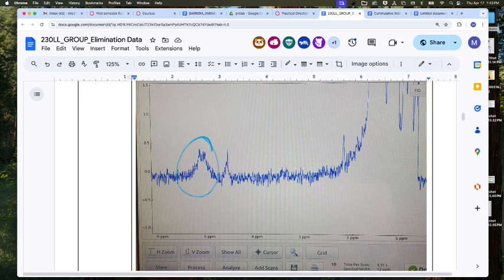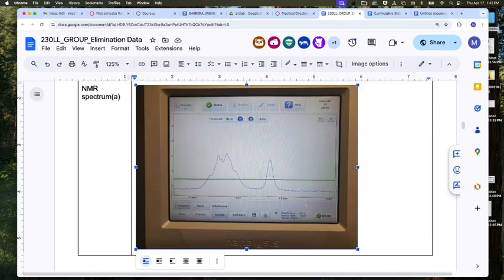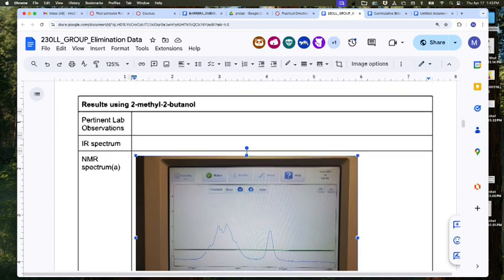Okay? That signal is now the bump upwards. It's so noisy that that's why you're seeing all those jagged lines. That becomes very difficult to go through and interpret because of where it's located. So if we increase the concentration, now we reduce the noise and it allows us to get a better peak. So when we're analyzing the spectra, this is the spectra that you should be looking at for the alcohol.